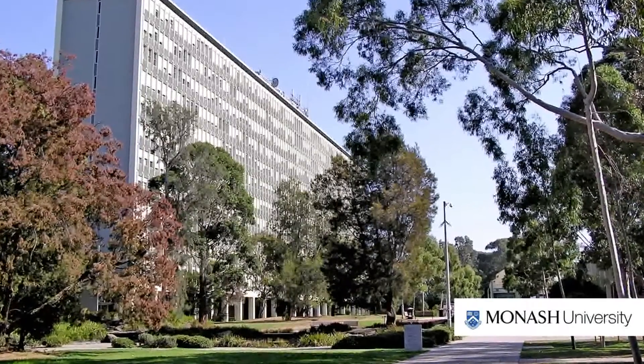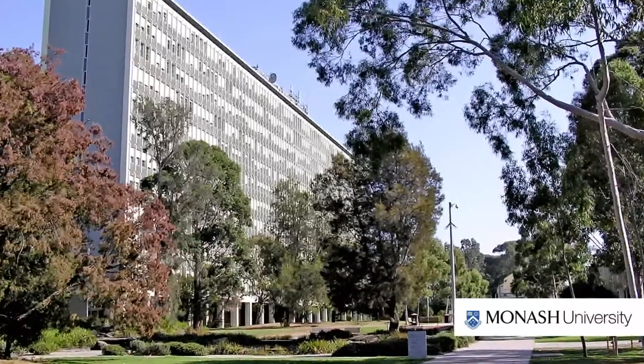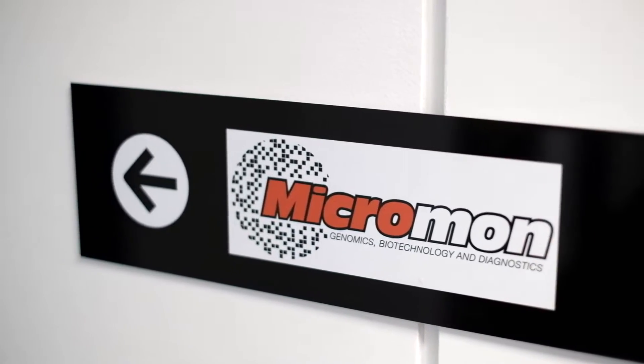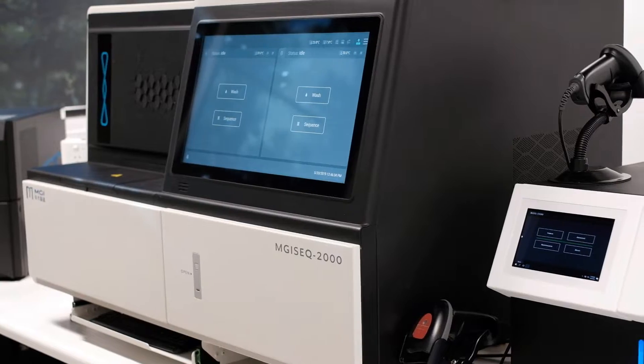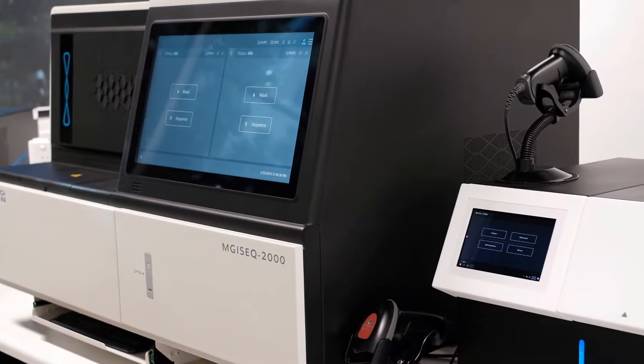And today we're at Monash University Clayton Campus and we're meeting with the team here at Micromon who are a sequencing service provider and we're here to see how they've implemented our MGI Seek 2000 instrument.